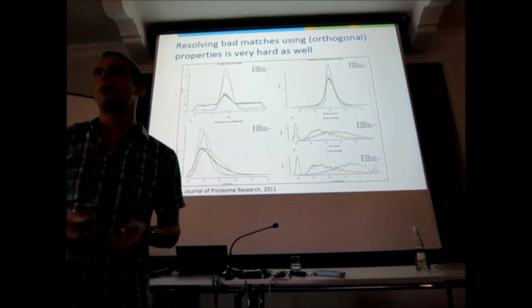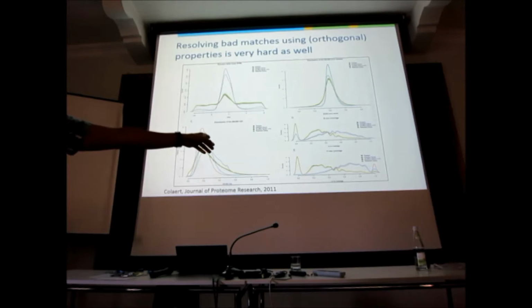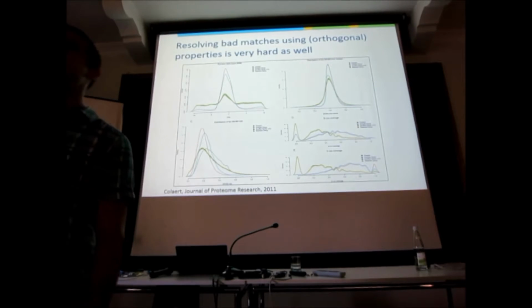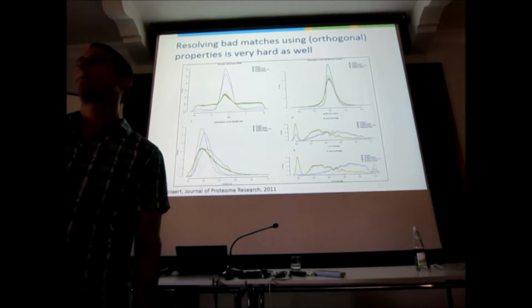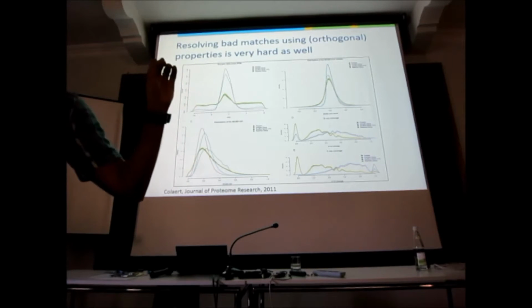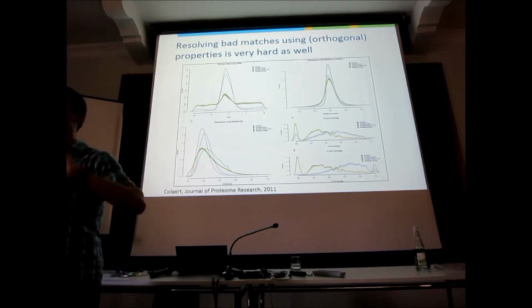And now you're creating a database that looks surprisingly, although only fractionally, but surprisingly like this one. And we've been doing this with a group in Ghent, and what we see is that our identification rates in the combined databases go down because of this problem. So this is really very close on our horizon, and it's a completely ignored problem.